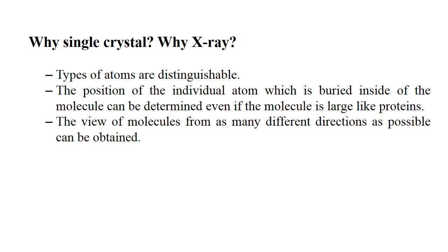Second, the position of the individual atom, which is buried inside of the molecule, can be determined even if the molecule is large like proteins. And third, views of the molecules from as many different directions as possible can be obtained. In addition, the relative positions among the molecules from different views can be determined precisely.